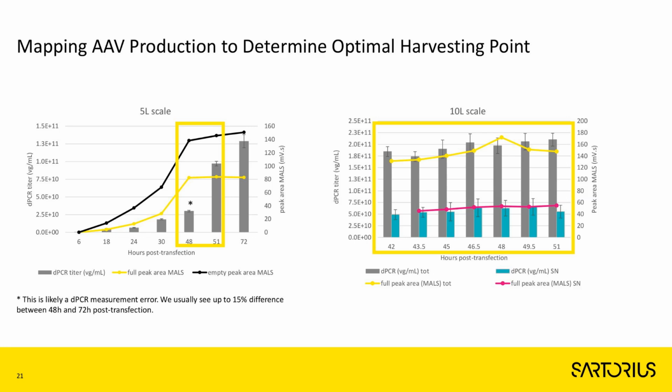So during this experiment, we have defined the optimal window for harvesting our AAV8 GFP harvest, which allowed us to first spend less time producing this material, and second, reduce potential impurities, because the longer we leave harvest in bioreactor, cells keep dividing, and we can have a potential increase of total DNA as well as total protein content.